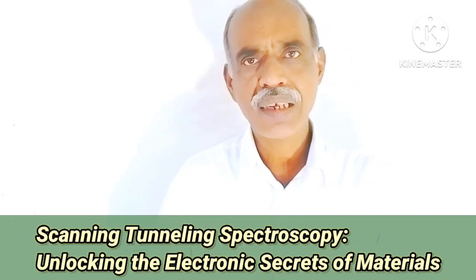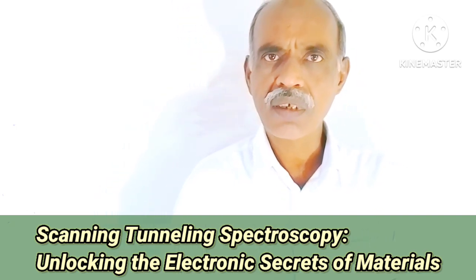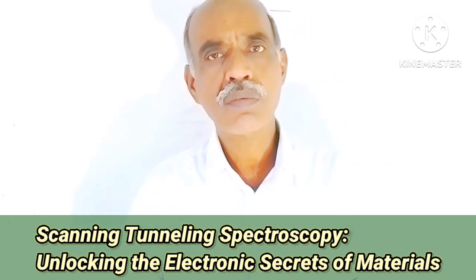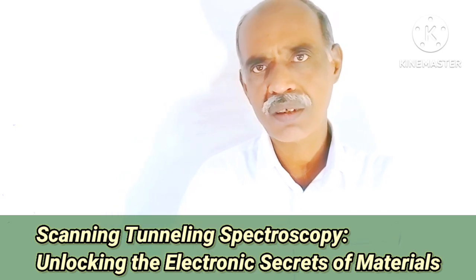Scanning Tunneling Microscopy. Here also the same principle, the quantum tunneling effect, is used. Quantum tunneling of electrons is happening in this case also.